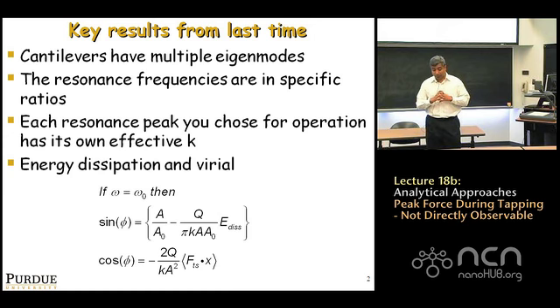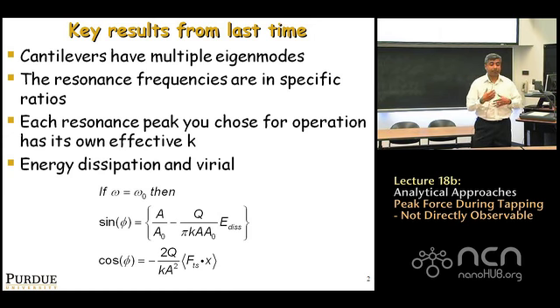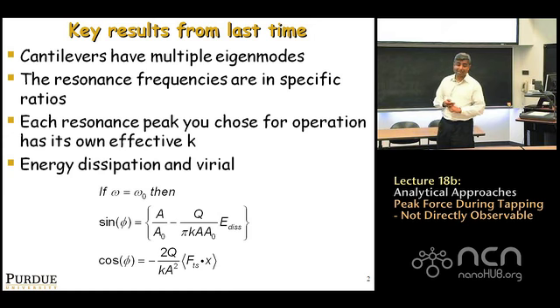Now, with that in mind, we went ahead and started developing an analytical framework for understanding what is phase contrast in tapping mode AFM, what it means. And we talked about the fact that it's very important to make a distinction between phase lag and phase lead in your AFM systems.